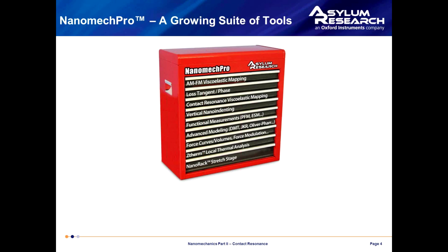Welcome, everyone. Thanks for listening in on our webinar. I want to start off by saying a little bit about what I could call our nanomechanical philosophy. The revolution that was started by Binnig and Rohrer with the invention of the STM, and then later Binnig, Quate, and Gerber's invention of the AFM, has changed the way we look at the world. In the case of mechanical measurements, our experimental laboratory has shrunk down from standard macroscopic techniques you may be familiar with to contact areas between the tip and the sample that are just a few nanometers on the side.